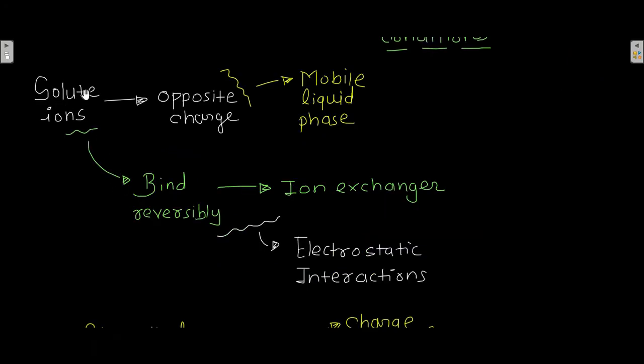The solutes of opposite charge present in the mobile liquid phase will bind reversibly with the ion exchanger, and this binding will be through electrostatic interactions.